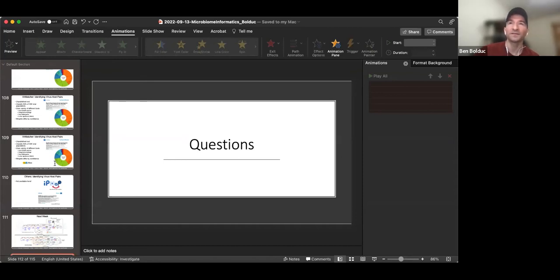But on the philosophy of binning viral genomes together, it depends on what level you're binning them at. Are you talking about a viral genome, a viral species, a VOTU? You need to be really clear and understand the terms that you're using, because in the viral literature, viral species, VOTUs, and viral populations all mean really different things. Some people who are thinking the same thing use all of those terms, and it's created a lot of confusion in the literature.